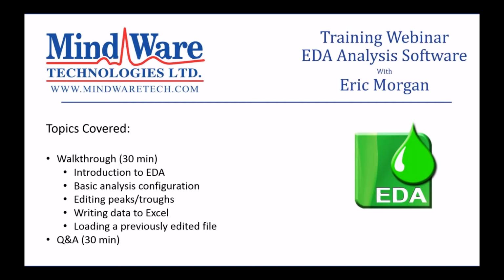We're going to look at the analysis screen, everything that's on that screen, the statistics that we're deriving. We're going to look at some editing techniques of inserting and deleting peaks and troughs and moving them around. Then we're going to look at how to write that data that we've analyzed out to Excel, and we're going to load a previously edited data file because it's not necessarily as simple as opening the file that you already edited.